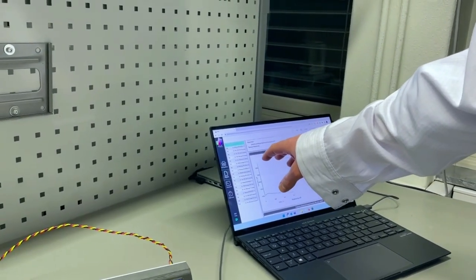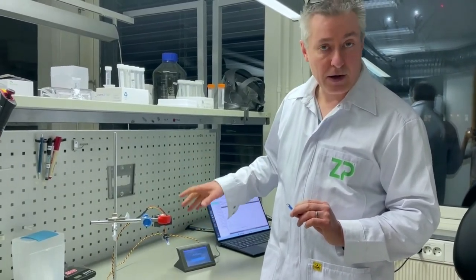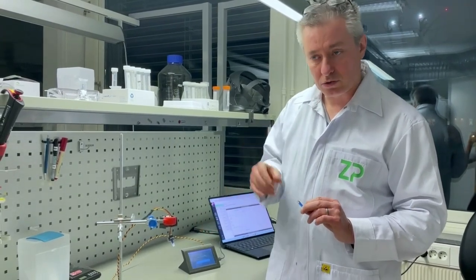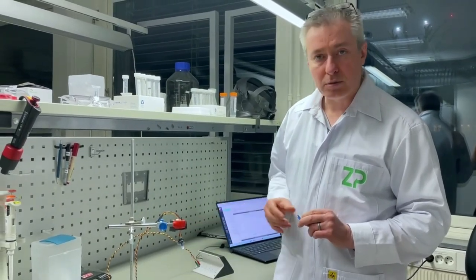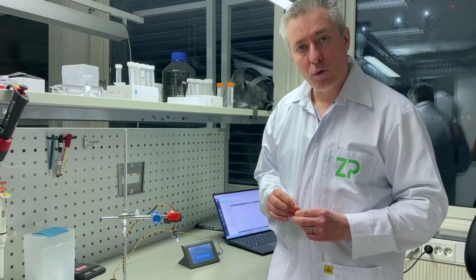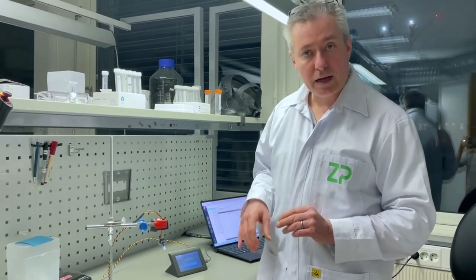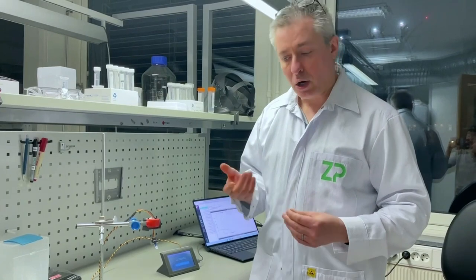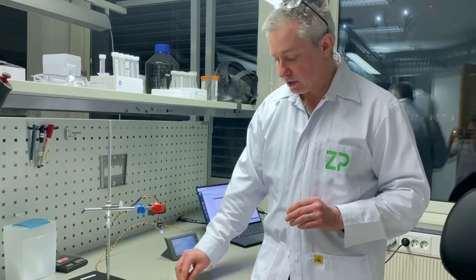The data goes to a cloud system called Julie, and you can have full access to your own Julie account in the cloud. In summary, this is a new six-channel potentiostat from Zimmer and Peacock — it's truly parallel, running all six channels simultaneously. The connection point is very generic, so it doesn't have to be a screen-printed electrode. The software automatically sends data to the cloud, so when you get home you can open it on your phone and see your data. If you have any questions, don't hesitate to reach out to us.